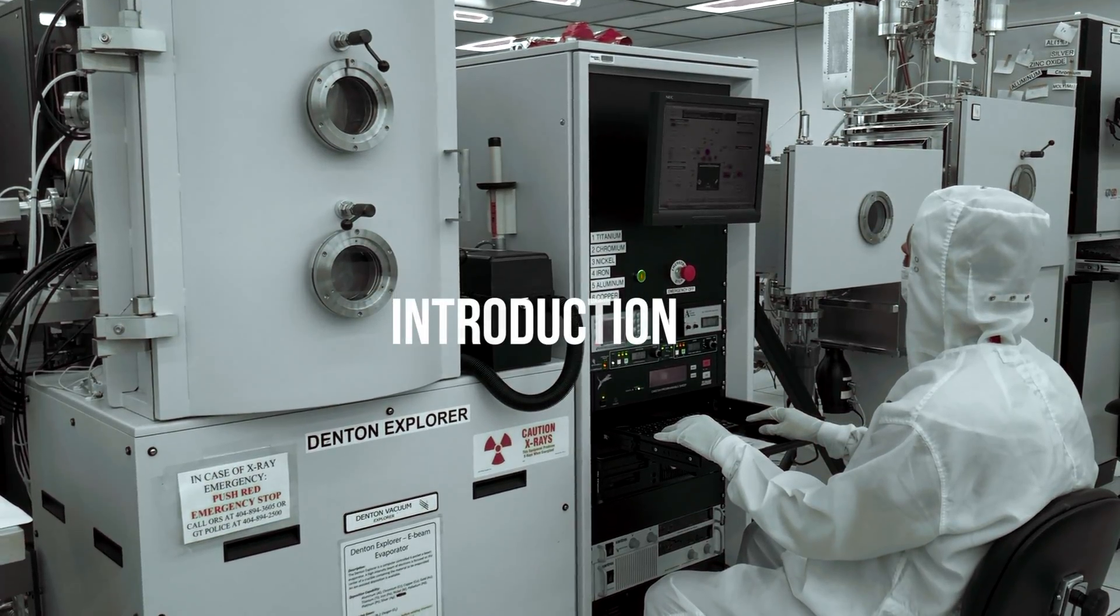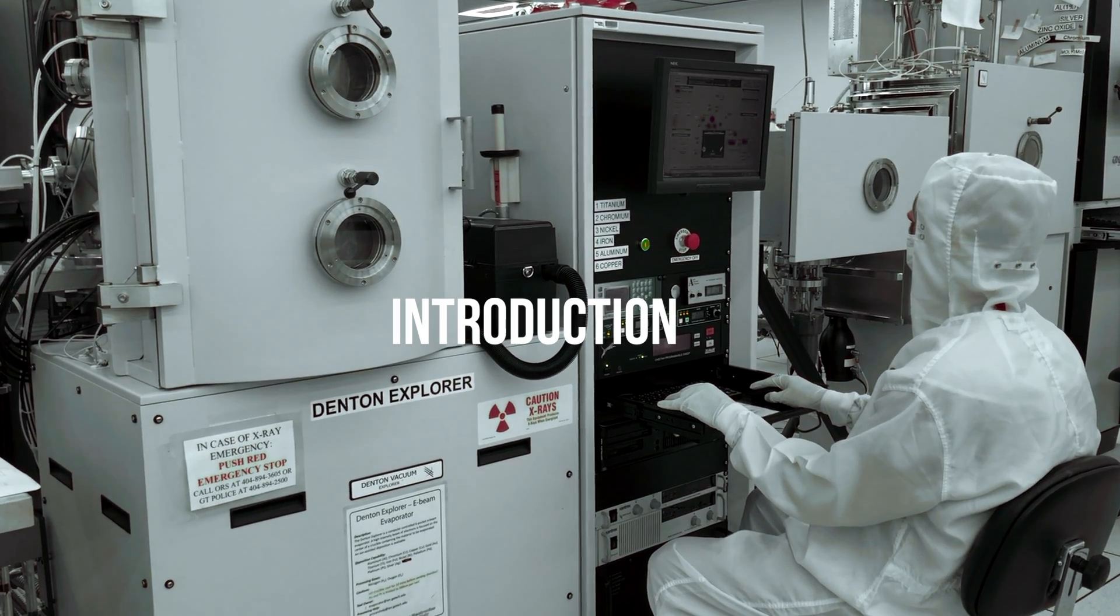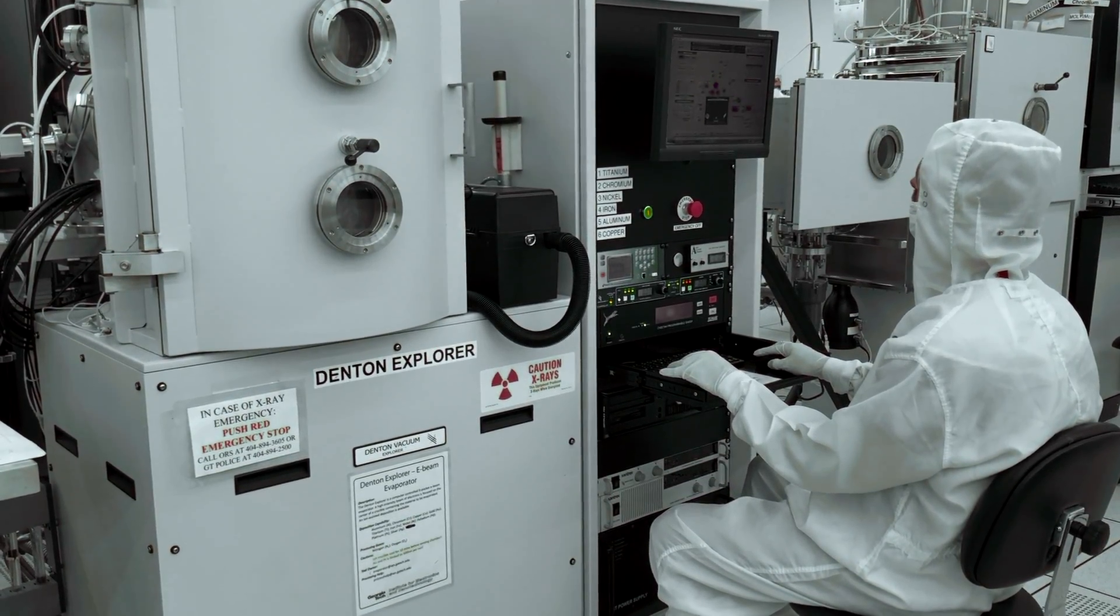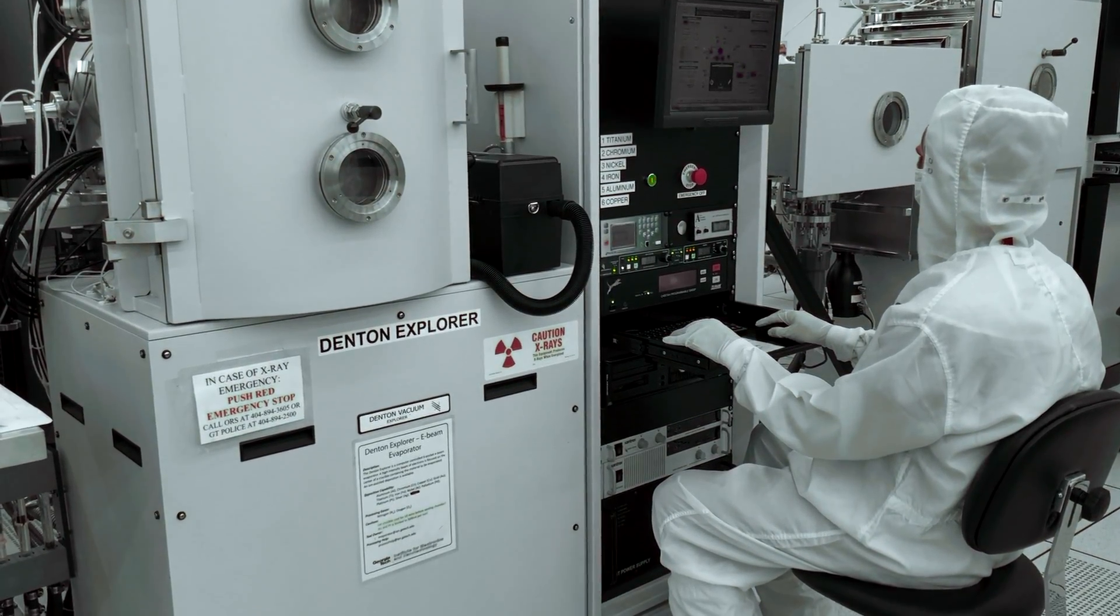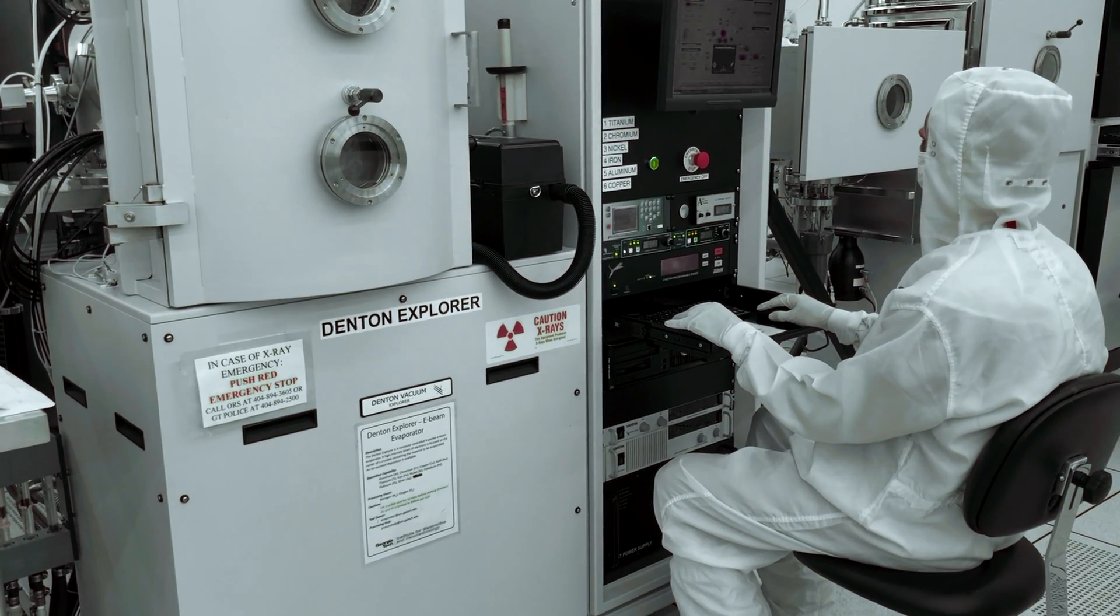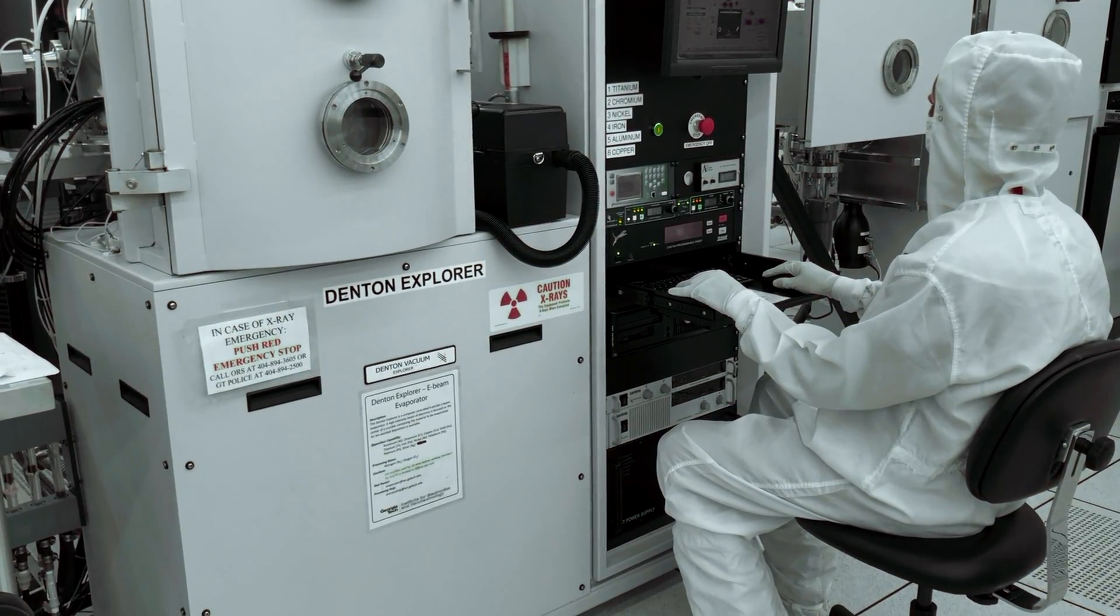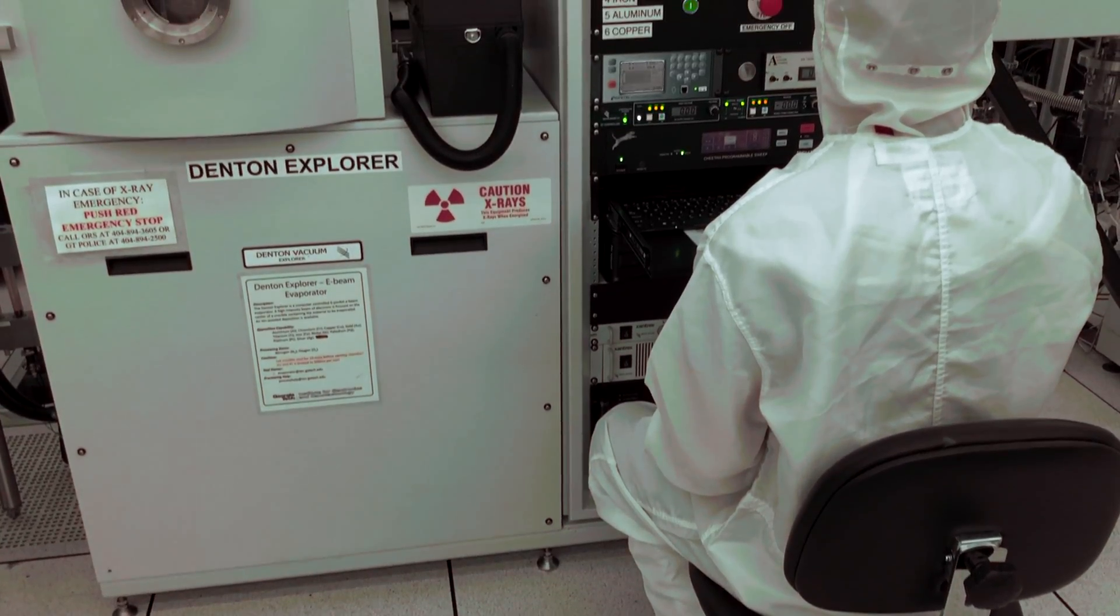The Denton Explorer is a six pocket e-beam evaporator system used to coat samples with various metals. A high intensity beam of electrons is focused on the center of a crucible containing the material to be evaporated.